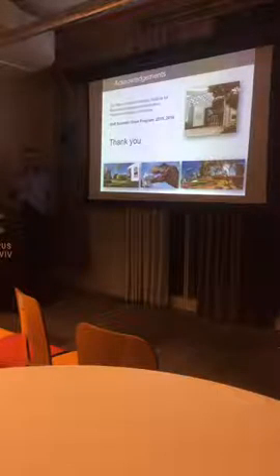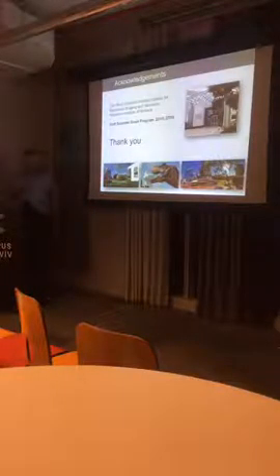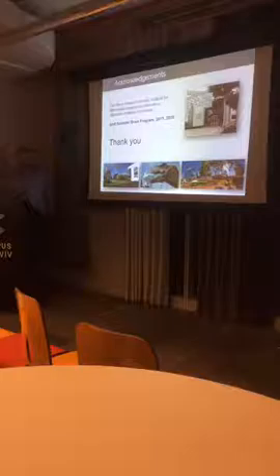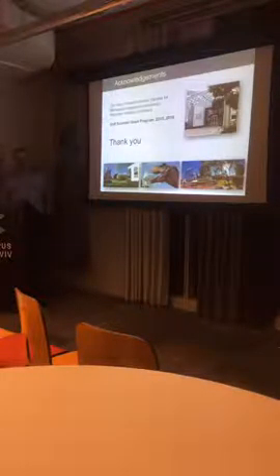But we try to fix immobilized. We also have a problem of the camera, but because we make some averaging, we're solving it, and also we have some Fourier filter, but it's not on this example that I show you. Here we don't use any super sophisticated. But averaging doesn't solve the issue of signal to noise.